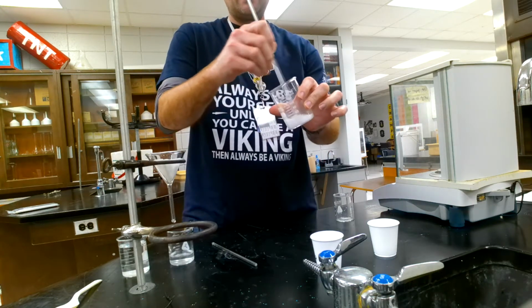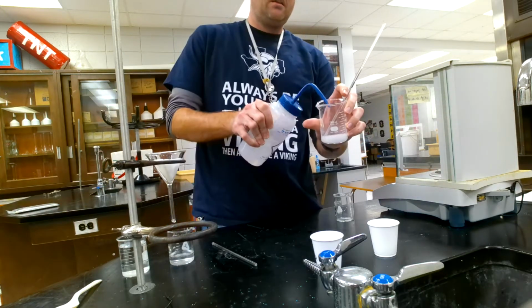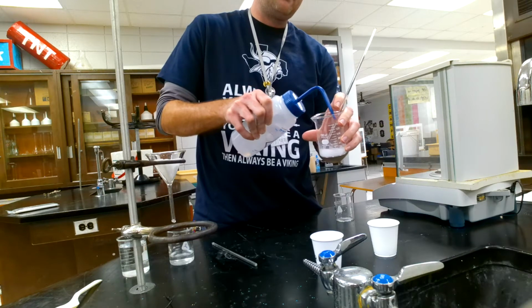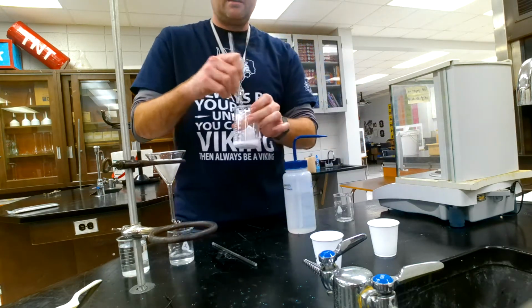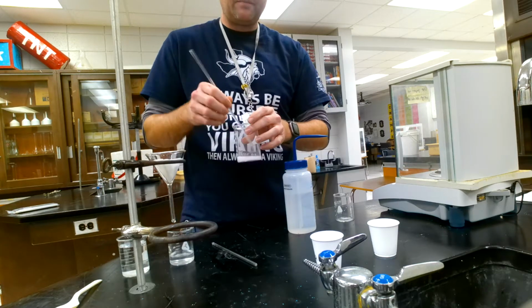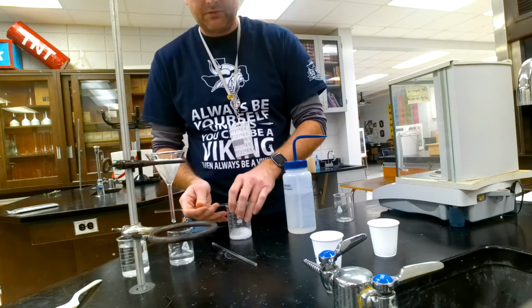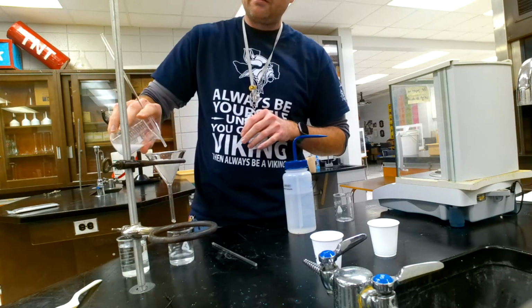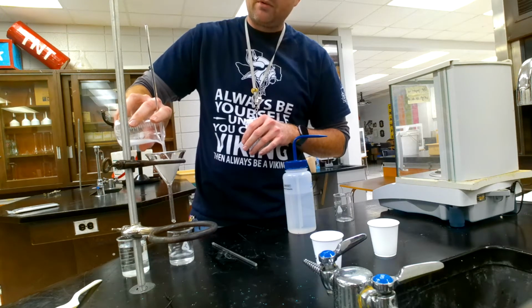I'm shaking and stirring this last part up, and it's a good idea to try to cut down on all of that stuff that's stuck to the side by spraying that down, so that it runs down, and that will help really work. We're not super worried about precision or your error at this point.